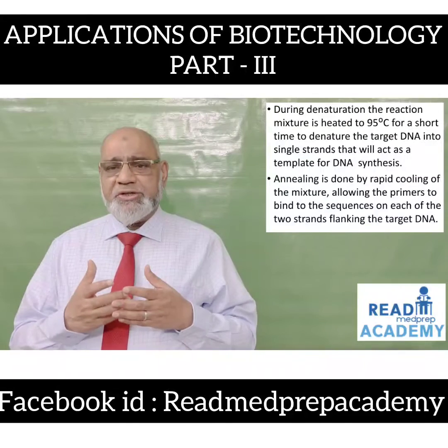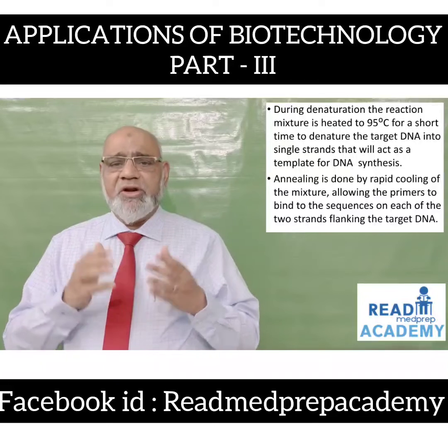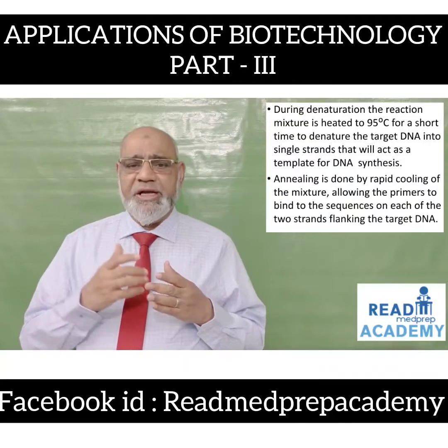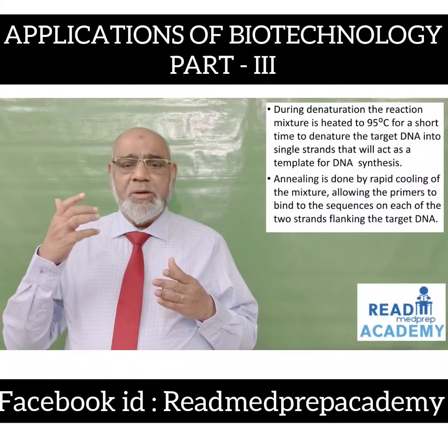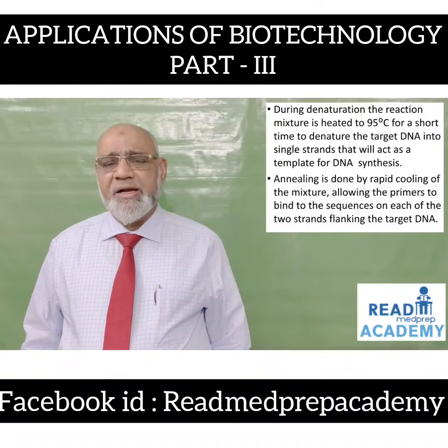During denaturation, the reaction mixture is heated to 95 degrees centigrade for a short time to denature the target DNA into single strands that will act as a template for DNA synthesis. Annealing is done by rapid cooling of the mixture, allowing the primers to bind to the sequences on each of the two strands flanking the target DNA.